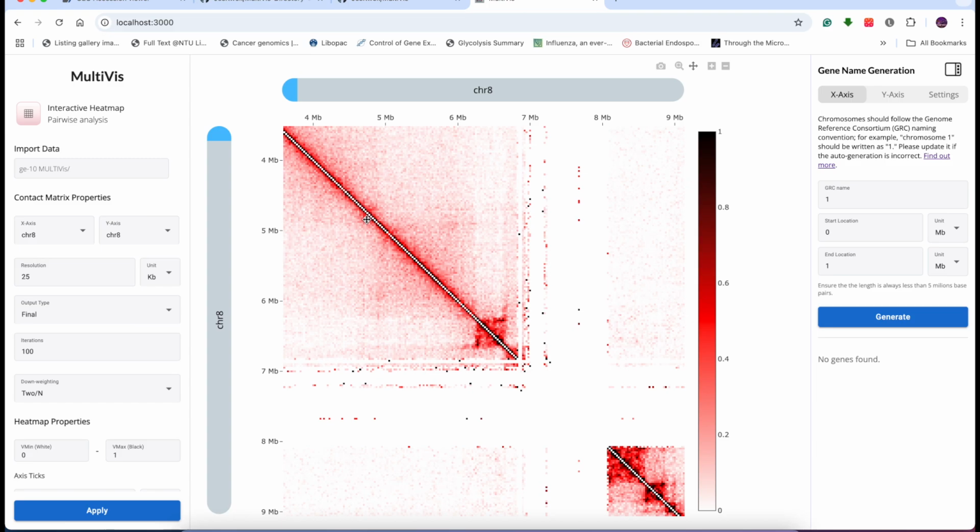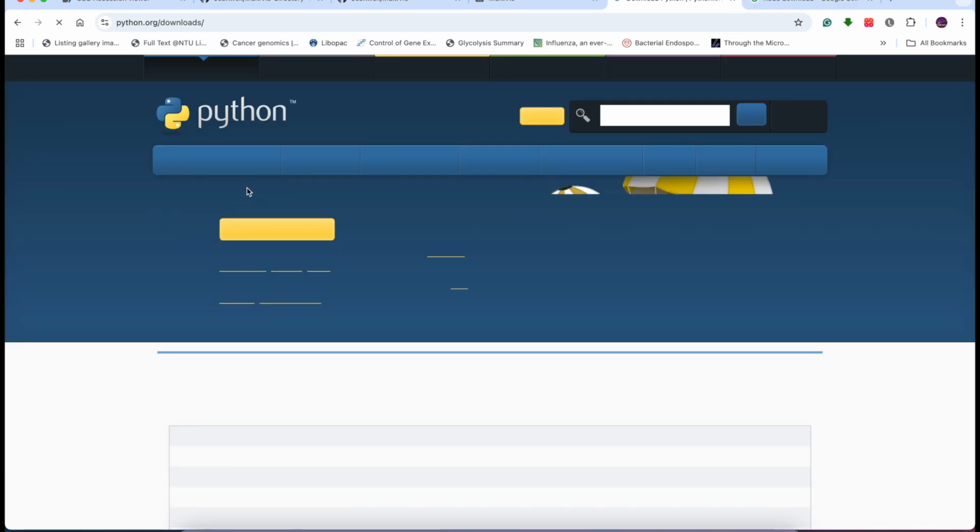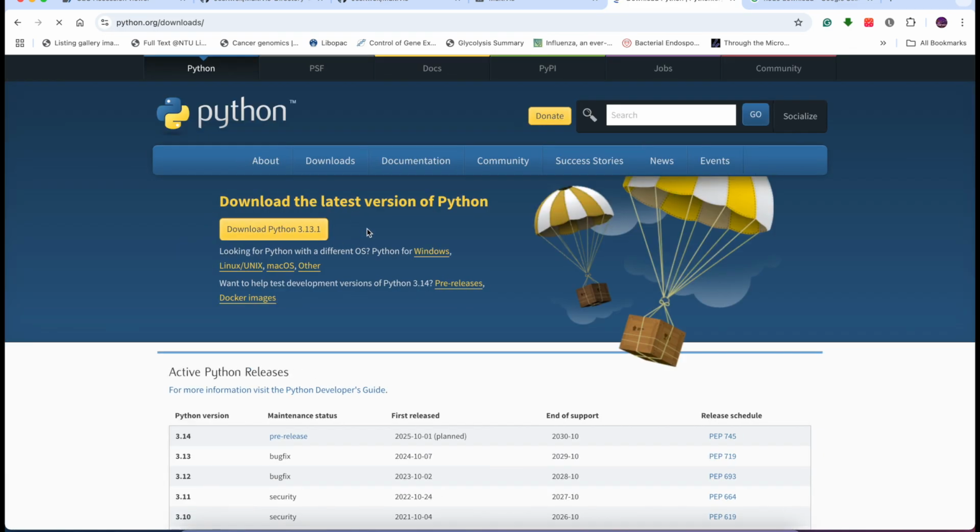In this video, you'll learn how to download and use MultiVis. Before we begin, please make sure you have Python installed on your computer. If you don't have it yet, simply search for Python download on Google, click on the first link, the official Python website, and follow the instructions to download and install Python.